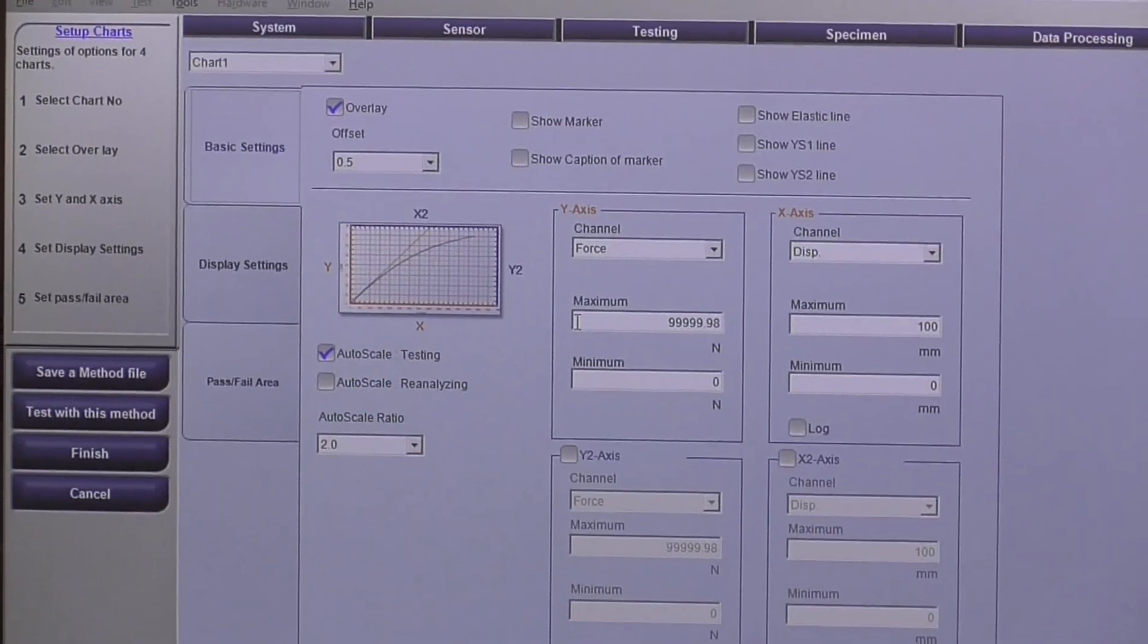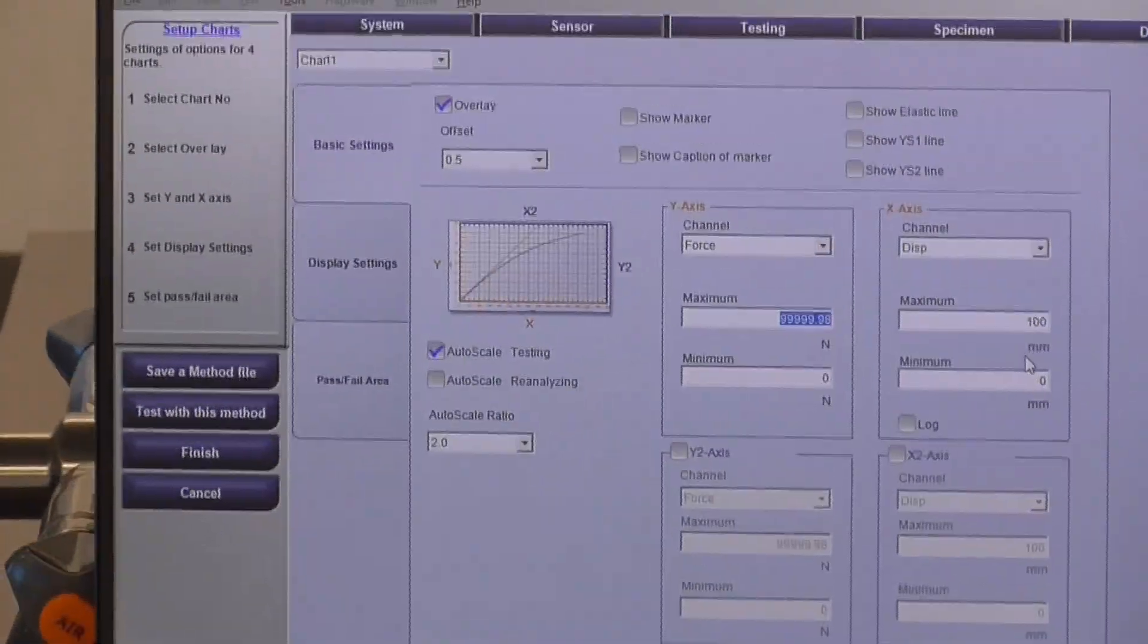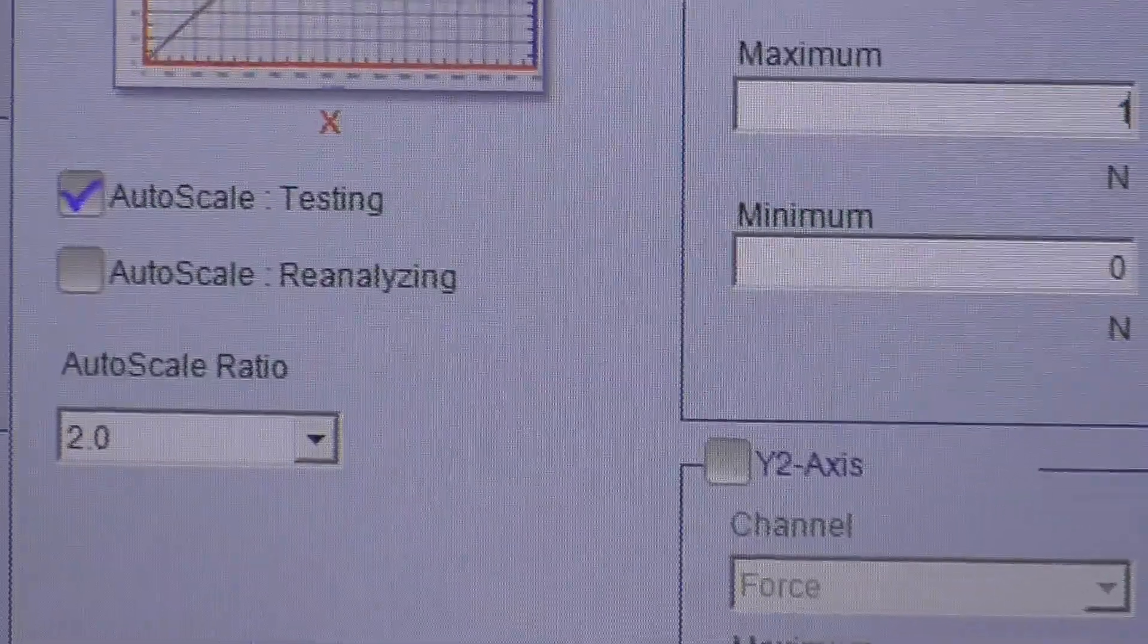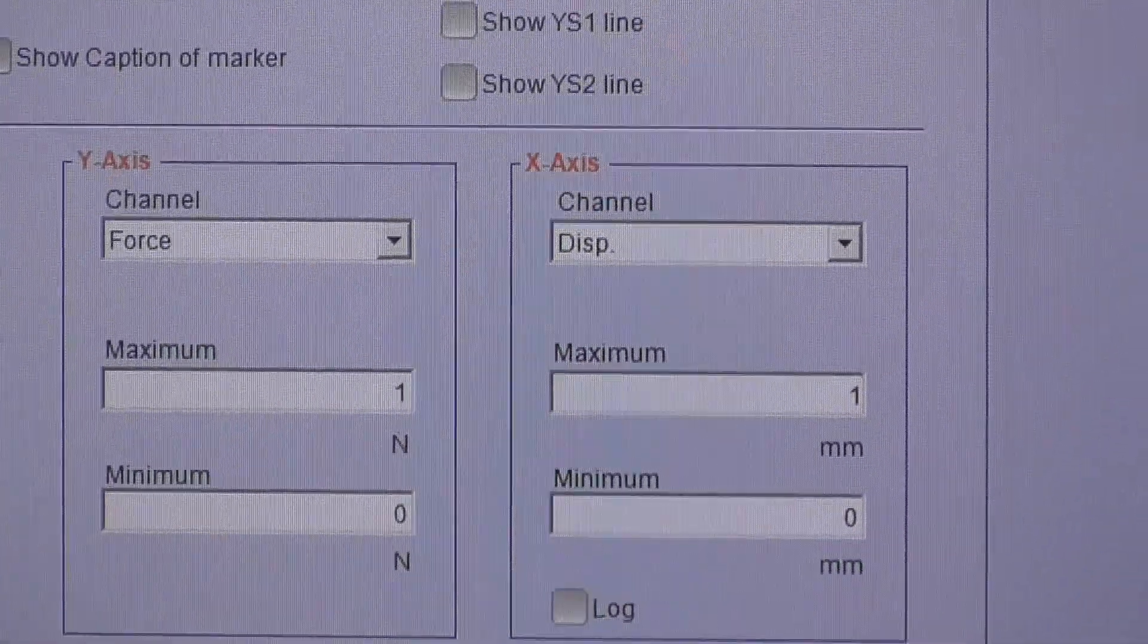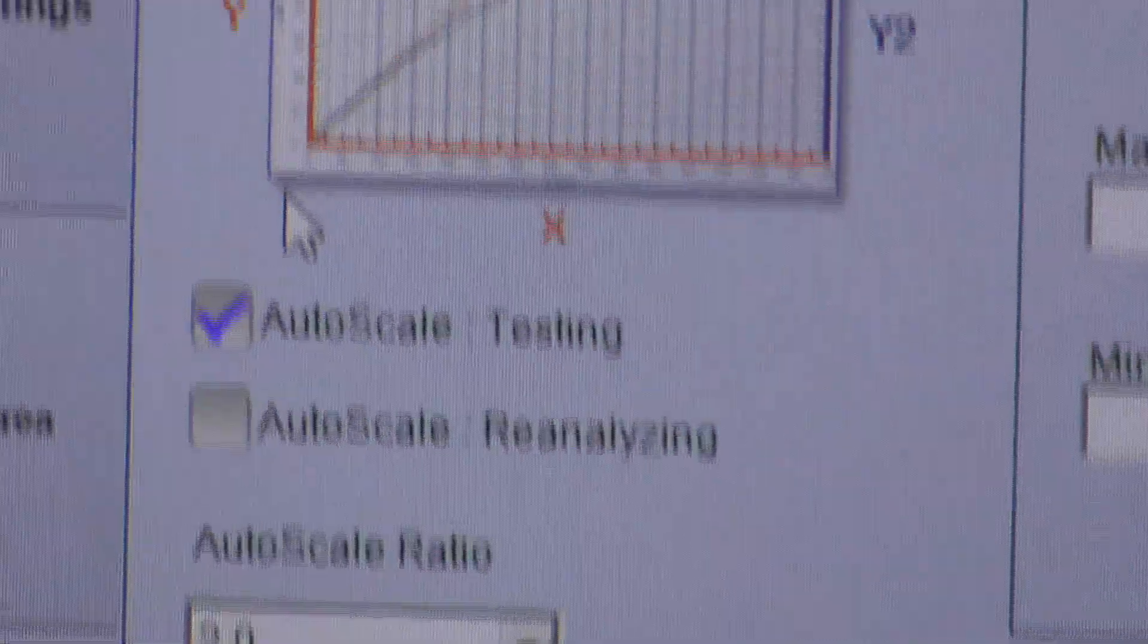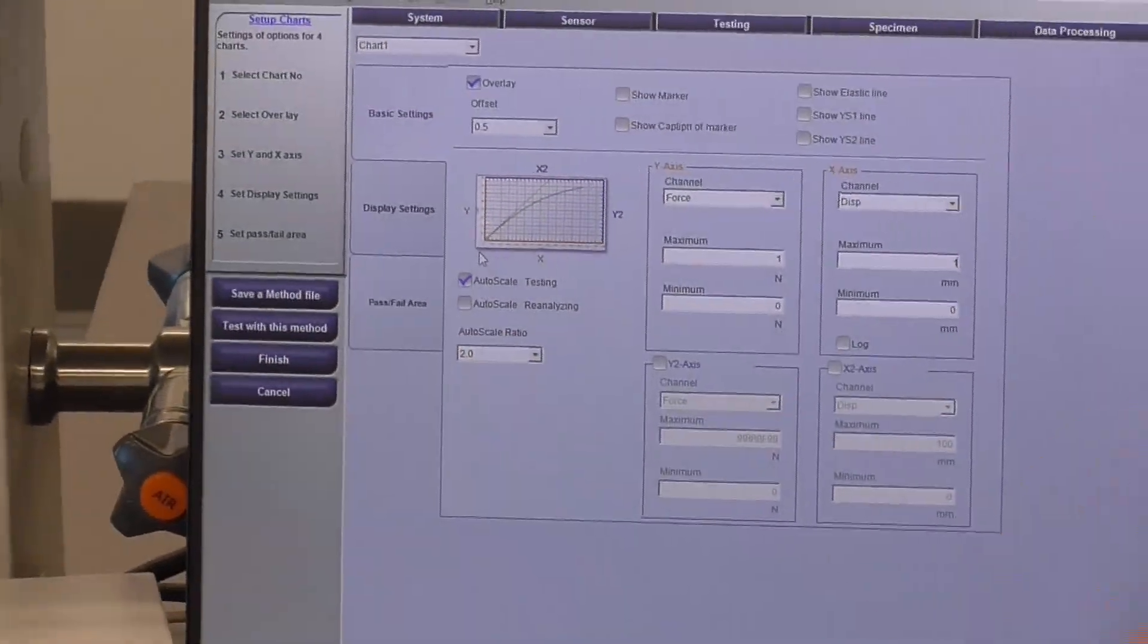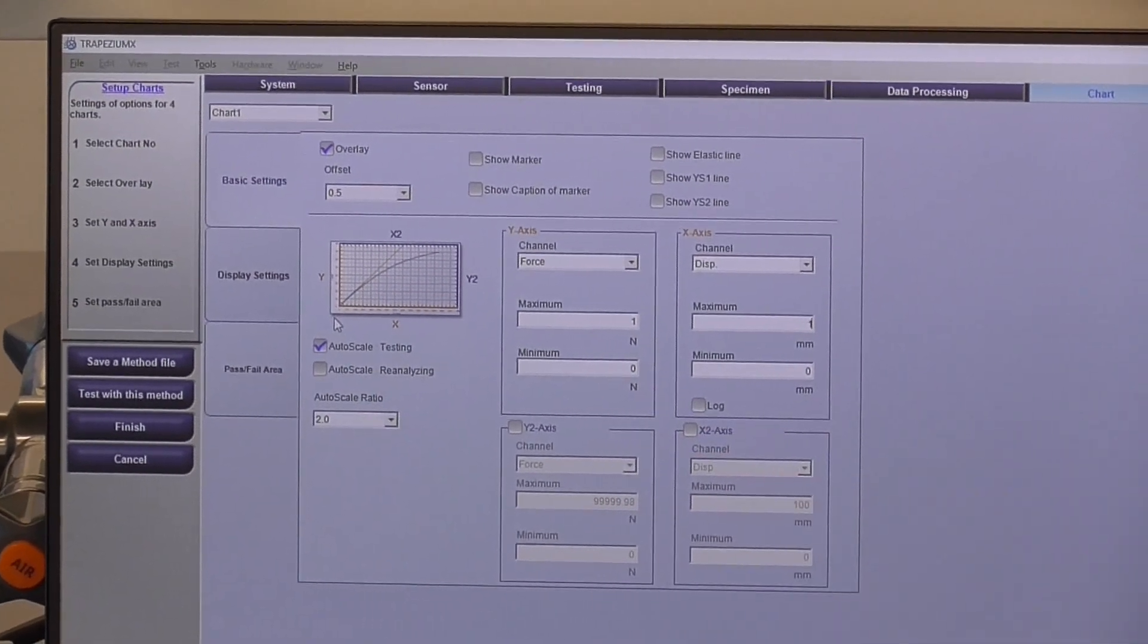Lastly, something that I like to do is I like to set the maximum of the graphs at a very low value. So I'm setting it at one newton and one millimeter. And then I have auto-scale turned on. So in that way, when you're starting the test, you can actually see the data propagate across the screen. As opposed to looking at this very large, especially if you're going to a 300-kilonewton capacity, looking at a very large graph and having a very small amount of data kind of work its way across the screen.